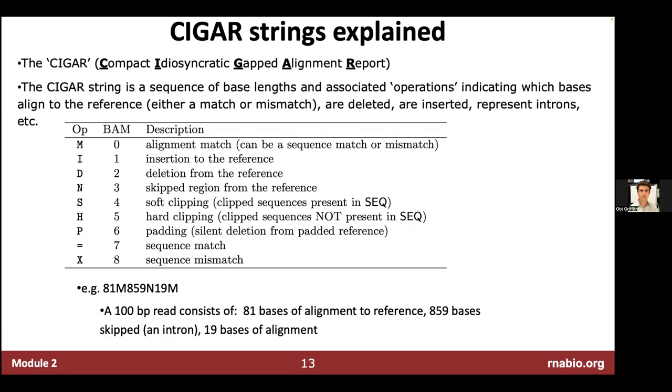Yes. In the translocation example, what would happen here? Would it still recognize it as a genomic region, where your reference is the normal? That is a good question. How translocations are represented in CIGAR strings.